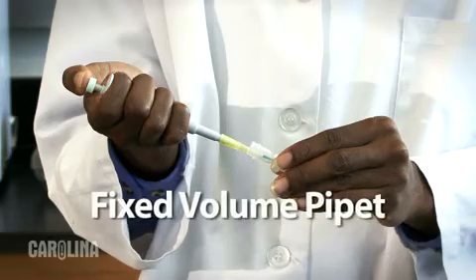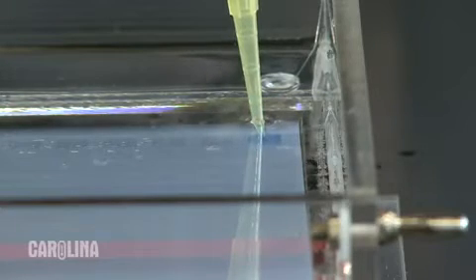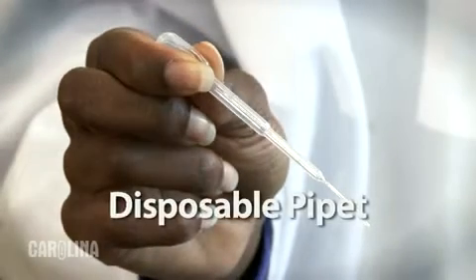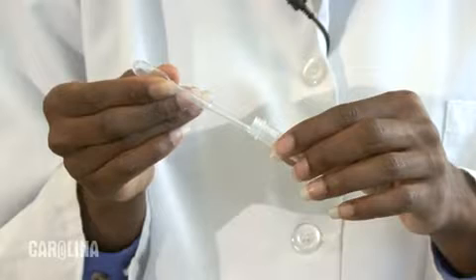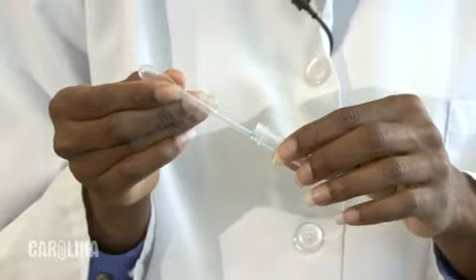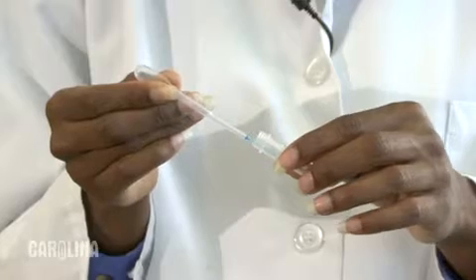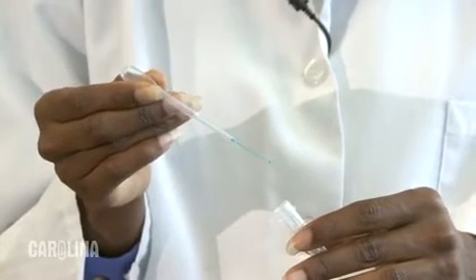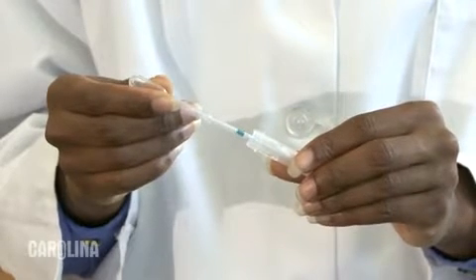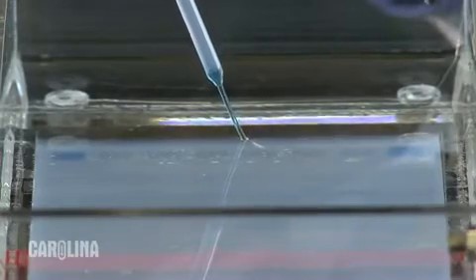Loading a gel using a fixed volume pipette is essentially the same. Be aware that some fixed volume pipettes have only one stop. If you are using a needle nose disposable pipette, gently squeeze the pipette at the conical shaped area just below the bulb. Place the tip of the pipette in the sample and draw the sample up into the pipette by slowly releasing your grip on the conical area. Don't stop squeezing the conical area entirely or your sample will get sucked up too far into the pipette.